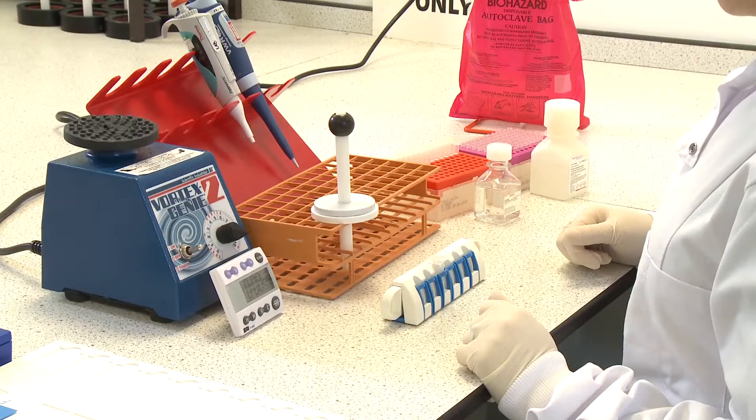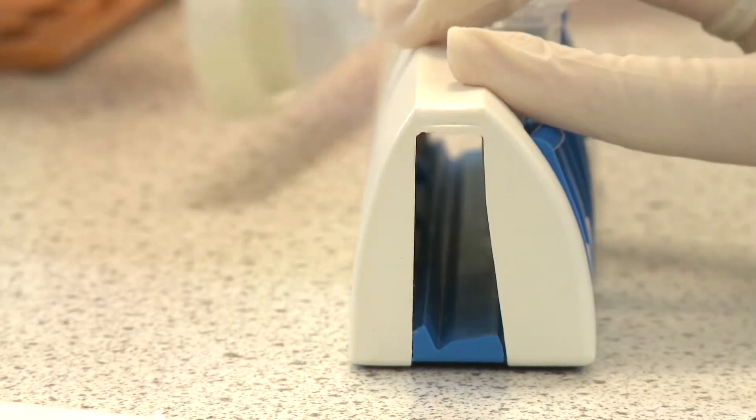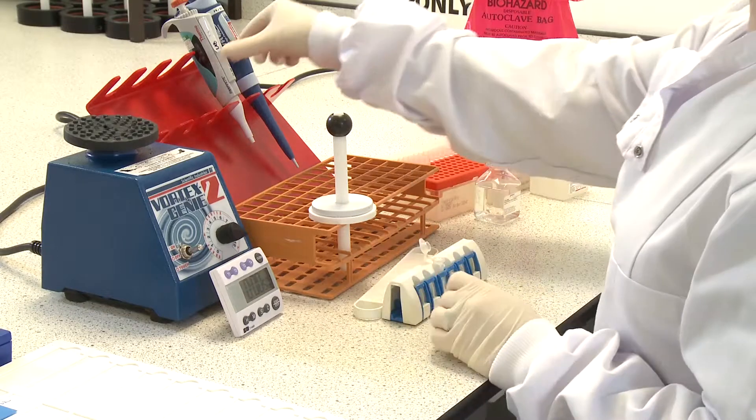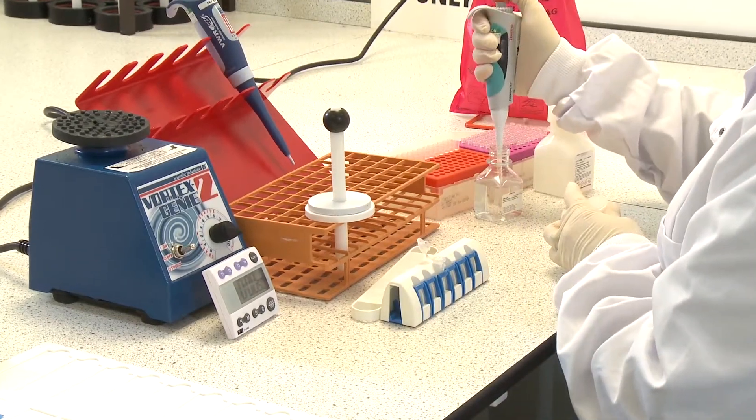Next, dissociate the dynabeads from the cyst-oocyst complexes. Refer to your local regulations to establish if a 1-step or 2-step dissociation should be performed. For the purpose of this video, we'll be demonstrating a 2-step dissociation. First, remove the magnetic strip and add 50 microlitres of 0.1 molar hydrochloric acid to the tube.